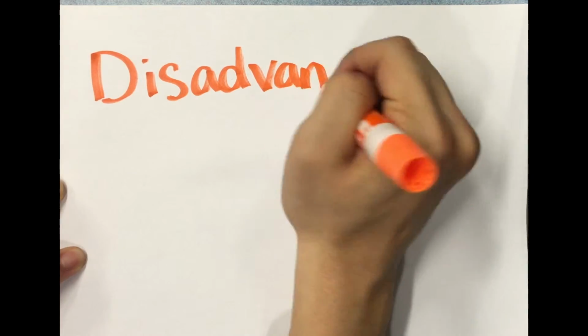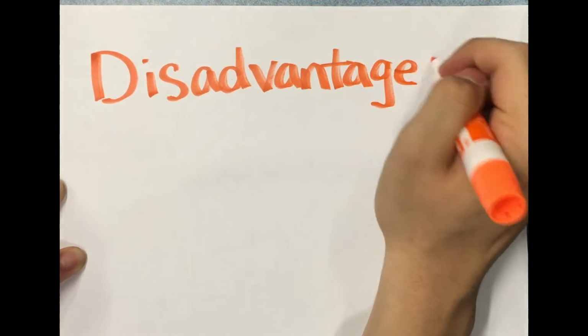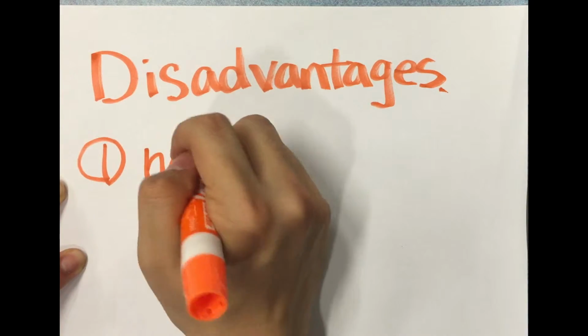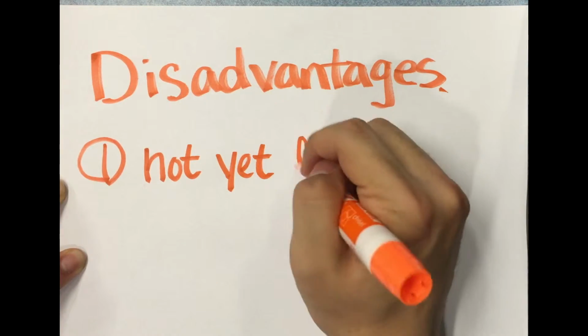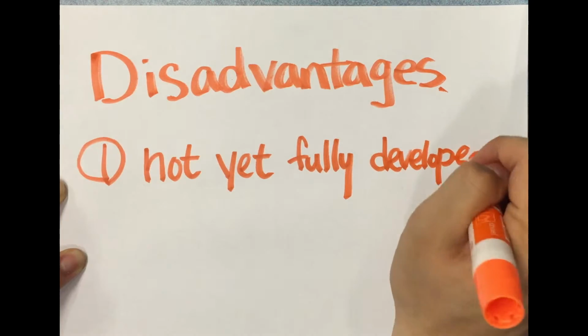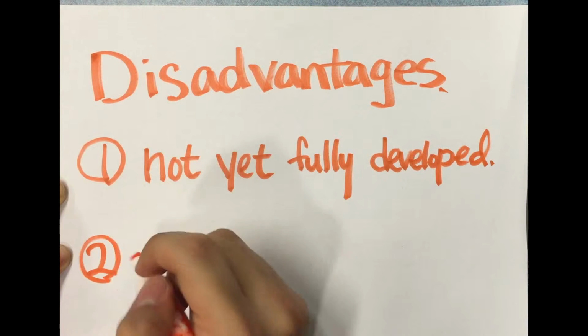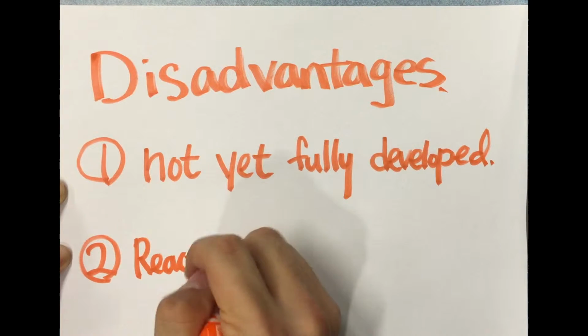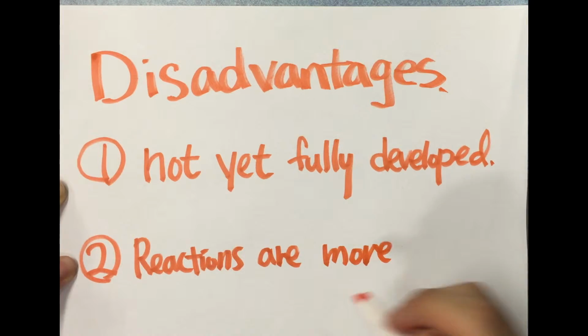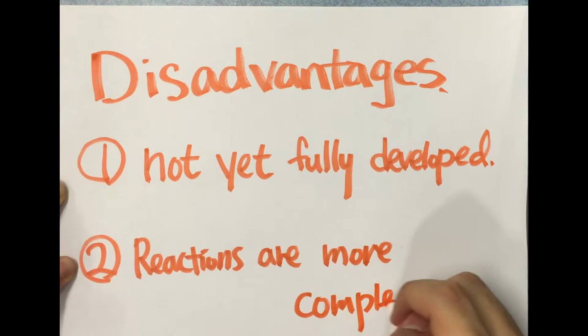Unfortunately, there are some disadvantages. Because this is a very novel technology, it is not yet fully developed. Because of increases in microscopic physical and chemical effects such as capillary forces, chemical interactions, and surface roughness, small-scale reactions can sometimes be much more complex for a lab-on-a-chip than in a conventional lab, so it is actually harder for us to put certain reactions in much smaller scales.